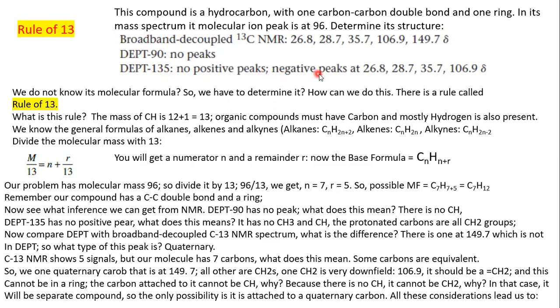In the DEPT, we can only tell about those carbons which have protons, that is the protonated carbons, okay? The proton-bearing carbons. So here are the proton-bearing carbons. This, this, this, and this. So it means they all are CH2s. They all are CH2s.